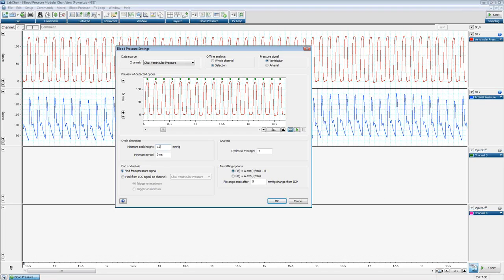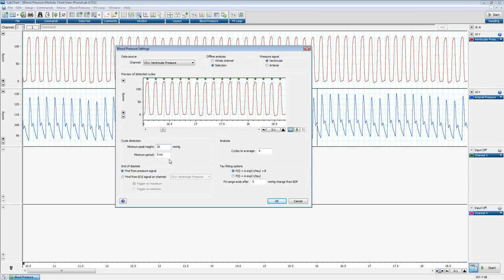To demonstrate: if we change the minimum peak height to 200, we're not identifying anything in the preview pane. But if we go down to 20, we're detecting every peak as it should be. If you're detecting artifacts you don't want, you can tweak these two parameters to miss them and only look at specific blood pressure pulses.